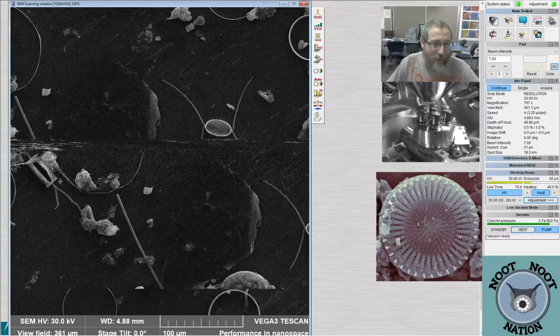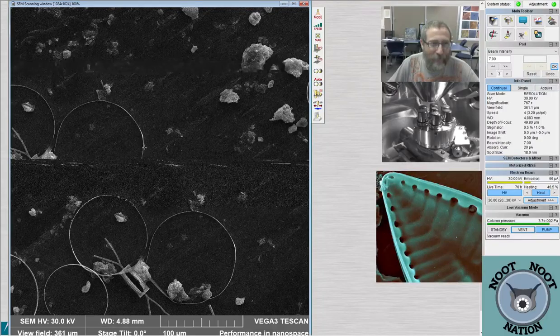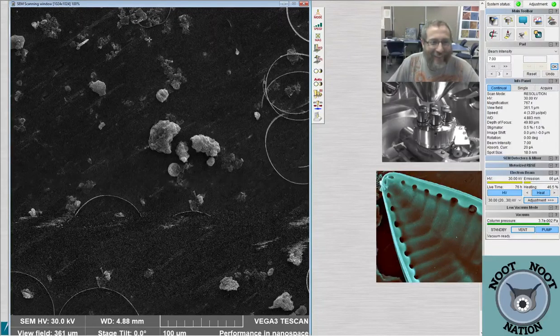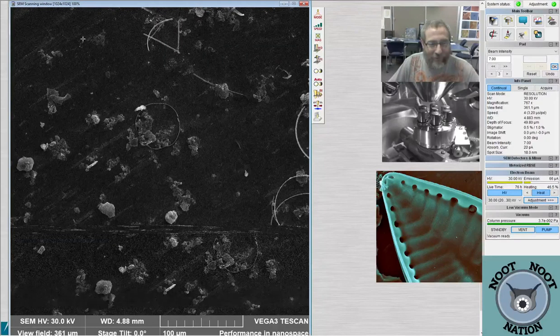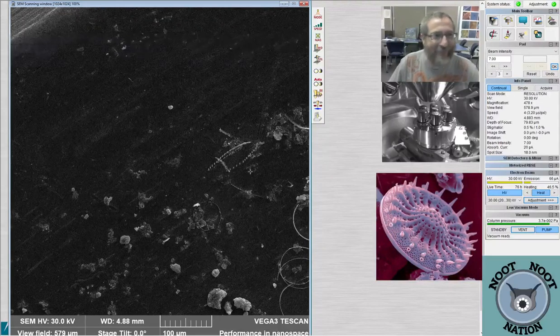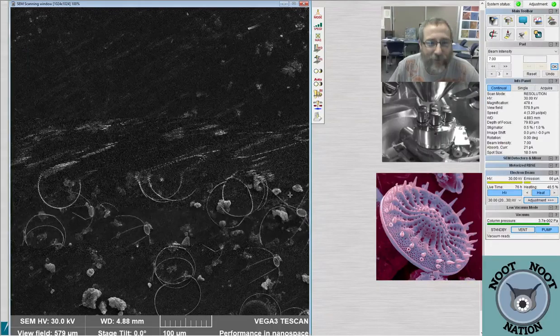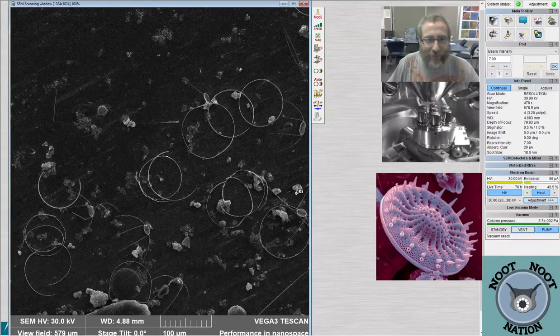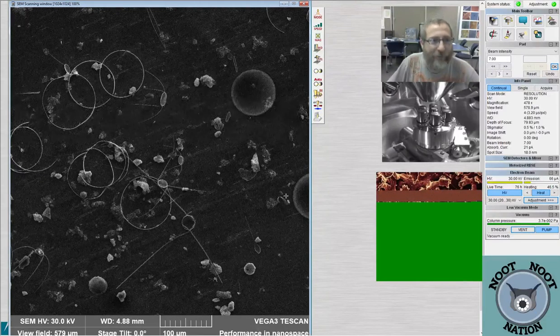The whole idea of me typing to try and get my words out through my fingers is not easy. I wasn't being judgmental. I just wanted to know if you thought that was Cylindrotheca, because I did have a Cylindrotheca in your sample from last night. So I'm pretty sure it's Cylindrotheca. Usually they have little tiny curls on the ends, and I didn't see those on that one, but it had all the other characteristics that I would normally associate with it.